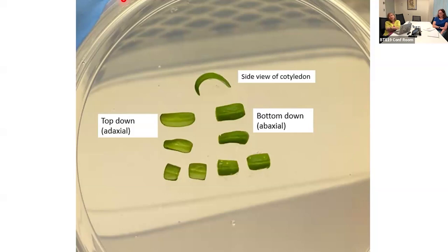So Rapidase is an enzyme that's actually used in the food industry, and that helps dissolve the pectin. So we use that for our tomato, our ground cherry, our goldenberry. You name it. Yeah, we use it for all our fruit.